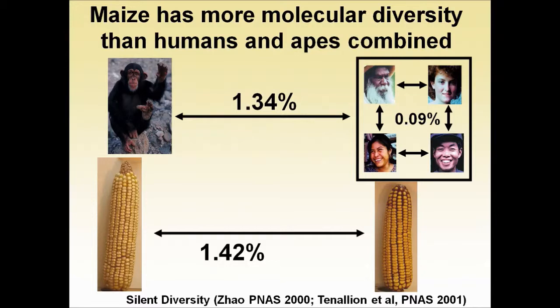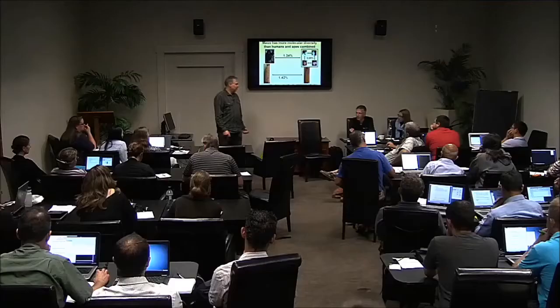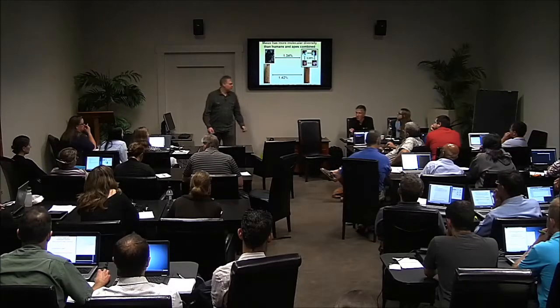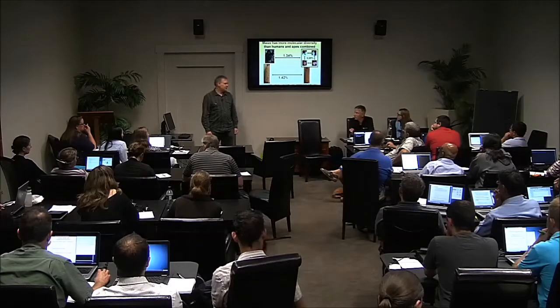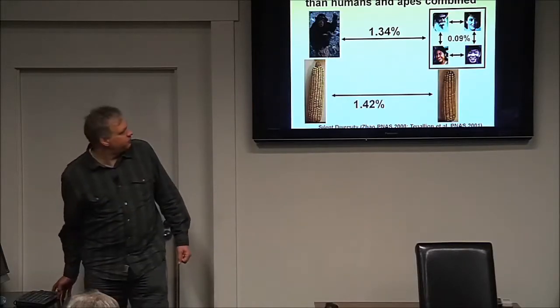And traditional SNP assays tend to have a couple of PCR primers and then another single base primer. So that's a lot of primer design, and those sequences need to be conserved across all the samples that you're working with. Otherwise, you get failure of the assay. So we had lots of trying to make markers in maize lines and then having them not work outside of the panel you develop them in very well. So that led to this GBS approach, which is less dependent on the conservation of sequence to some level. I mean, it's still in there, but not as bad as traditional SNP markers.